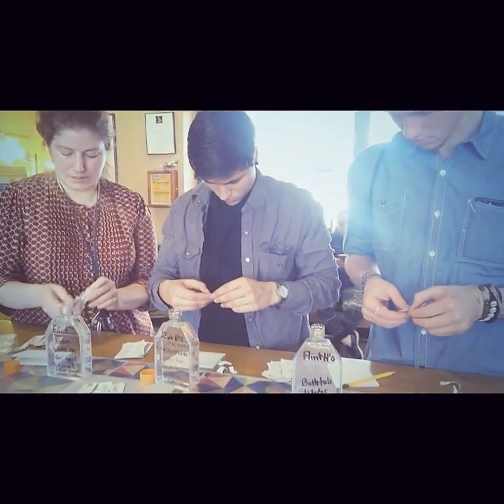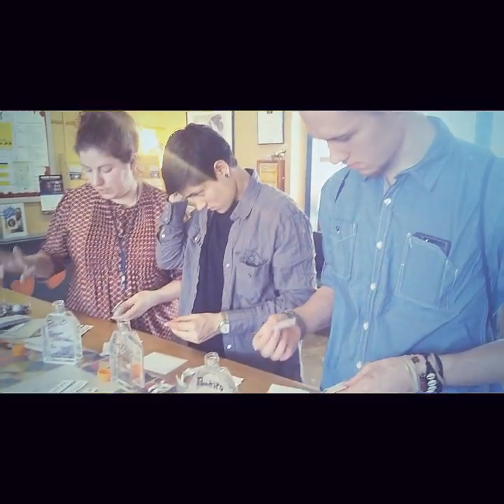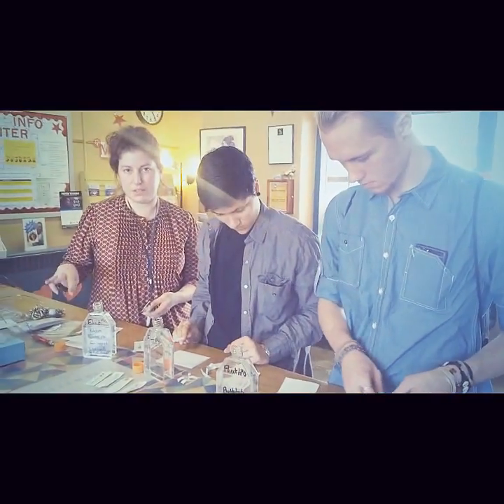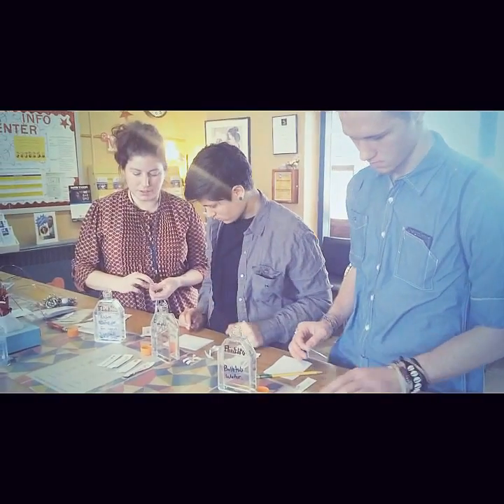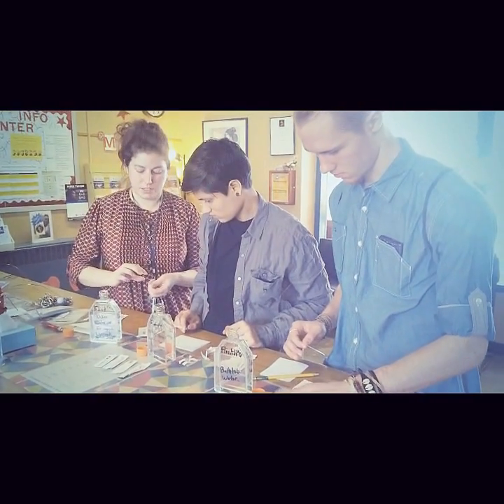Nitrates and nitrites. And what we're doing now is there's actually two different brands that create the dipsticks for testing. So we have two different brands here that we're looking at comparing the results for.